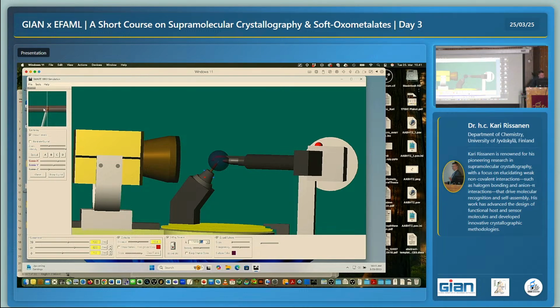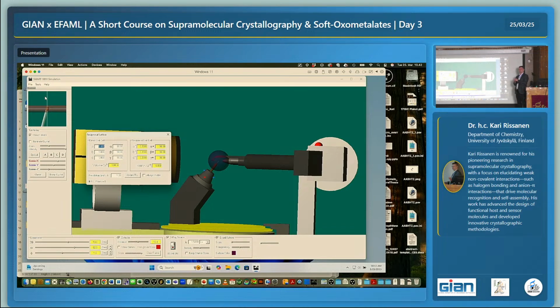So now let's define the crystal. What we have to know, remember there is a unit cell, and the unit cell can have 7 plus 7, 14 different forms, let's call it like this. We have to know this in order to see the diffraction, because the Miller indices where the reflections are coming are related to the unit cell. Now there is this kind of default unit cell, and then I accept this, and then something starts to happen. And now I say update this one, and now an interesting thing happens.